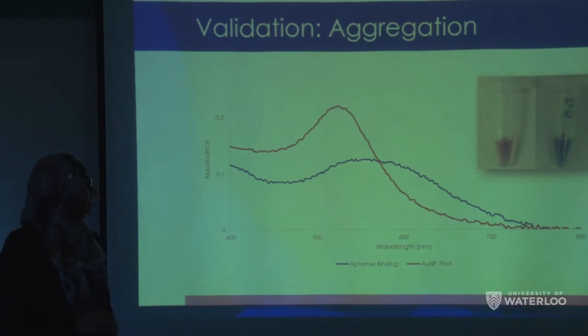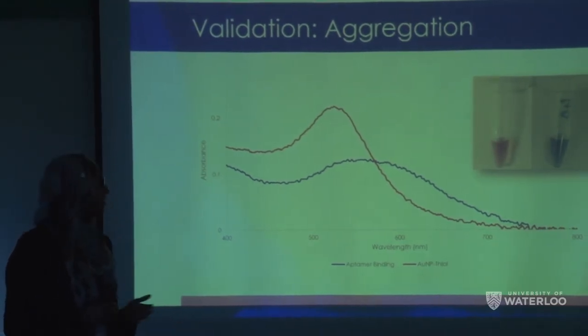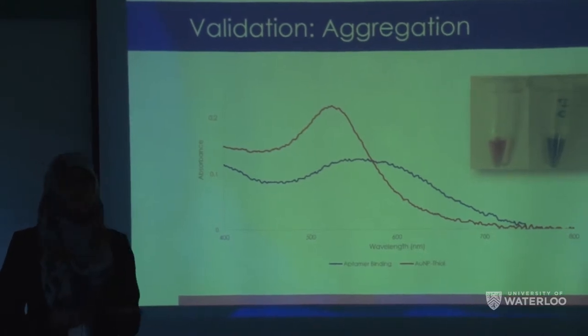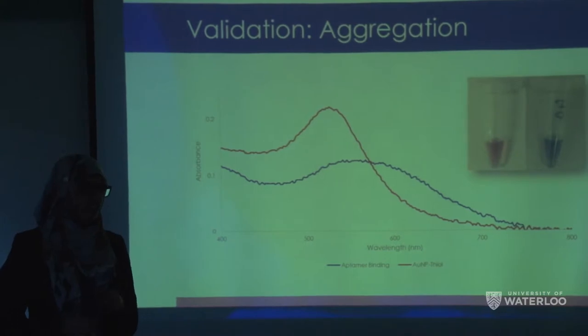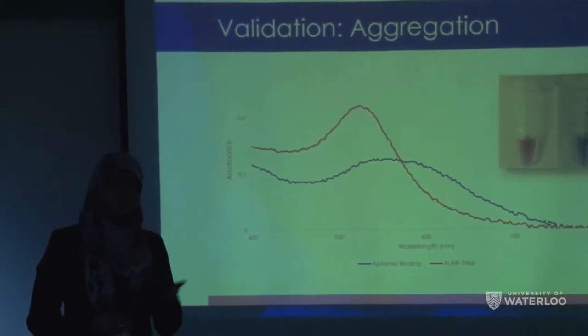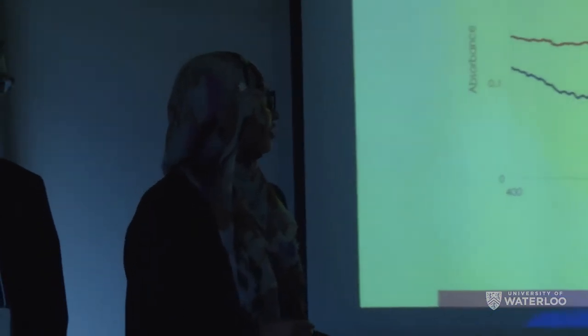So now that we have a sensor that is working, in terms of we can see a color change with the naked eye, we want to be able to quantify this further. And we decided to use NanoDrop UV-vis to be able to see the change with the binding of aptamer and with the addition of gluten and something that is gluten-free. So the first test we did was to check if our aptamer was actually causing the binding properly.